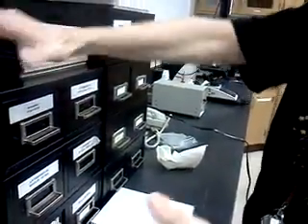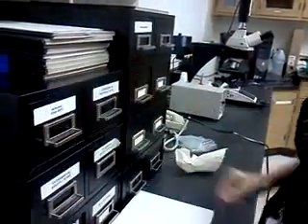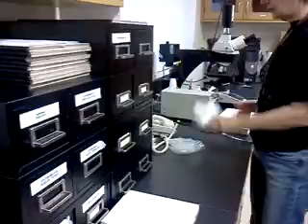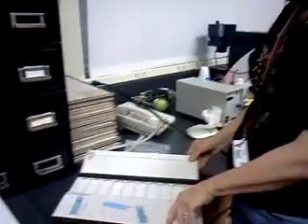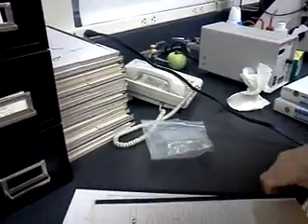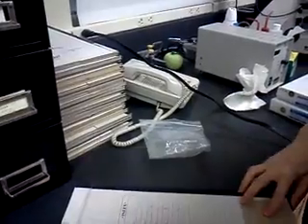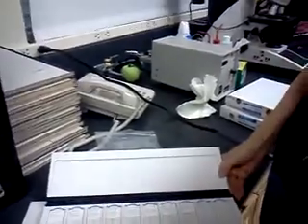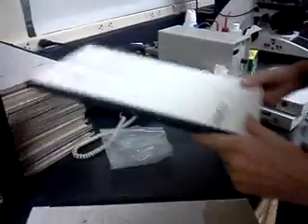Other people, like I said, he had these big map drawers and then these nice little slide holders, and they were all laid out there instead of in boxes, but that wouldn't have worked for us. We don't have enough room. I wouldn't recommend keeping them this way because it's a nightmare, and I'll show you the nightmare we have right here. These all have to be filed, and if you get behind, where is it now? The one you wanted? Unless you have a good memory, and I know what's in that stack, but nobody else would know what's in that stack.